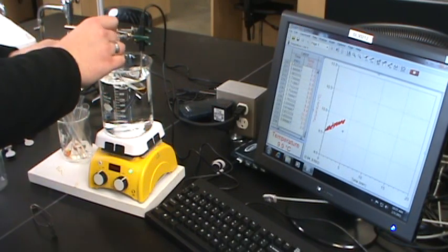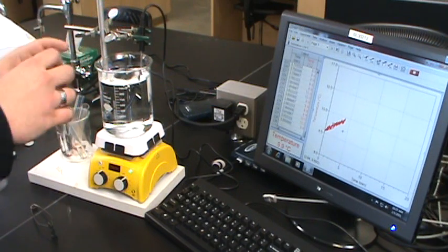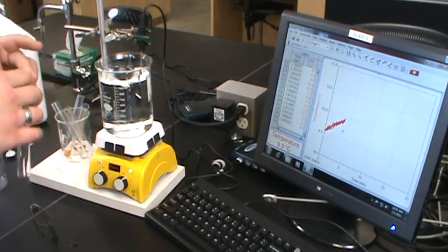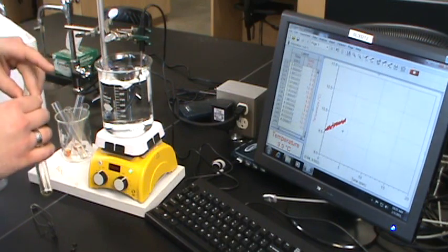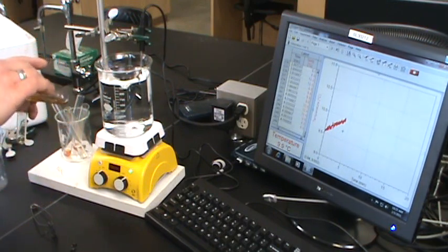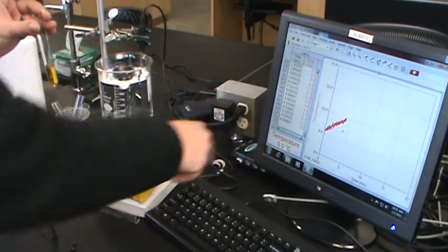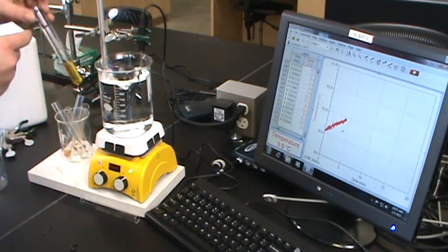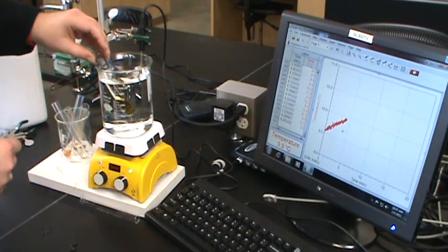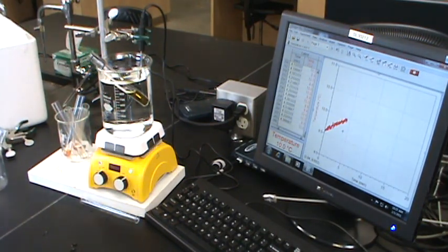So let me grab that and go ahead and mix. Now this one, you can keep track of any number of different ways. You can probably look at the clock on the wall. You could just make note of the time that's being collected there. You could keep a stopwatch going. I'm going to put the clamp back on that and get it back in there as soon as possible. So now my reaction has started.